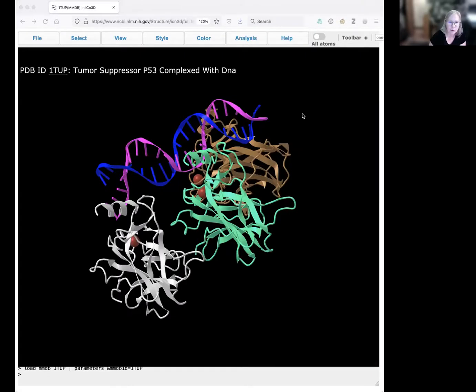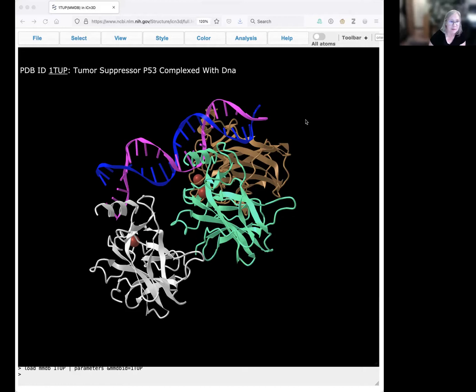Hi, this is Sandra Porter, and I'm going to show you how you can find salt bridges, also known as ionic bonds, using ICN3D.